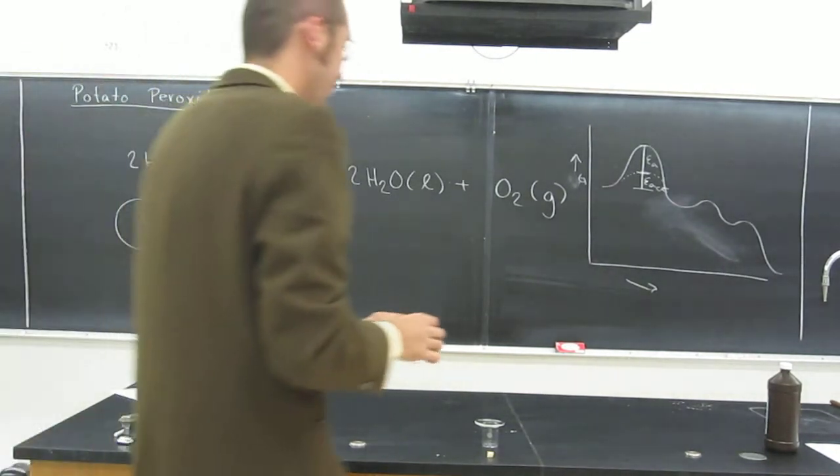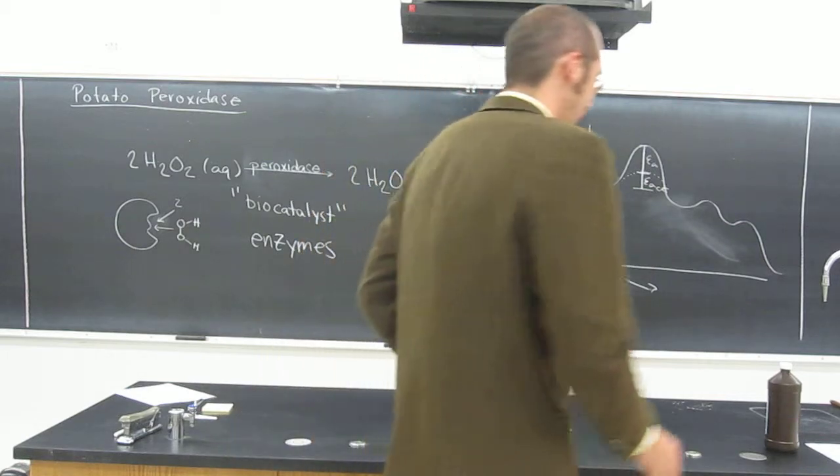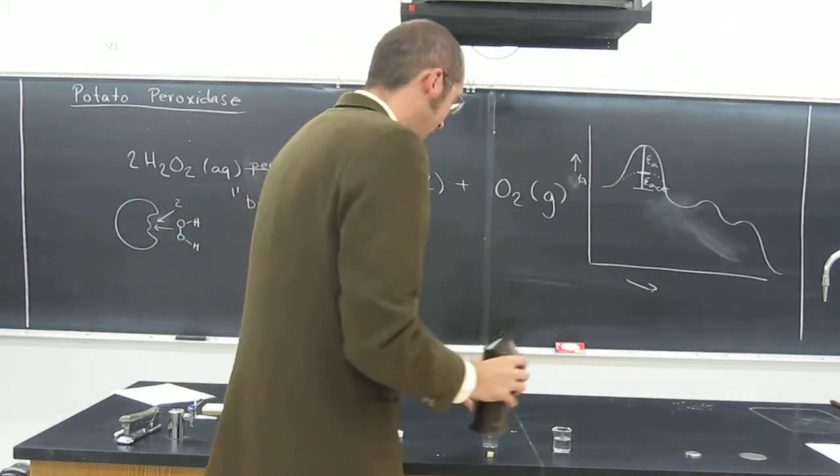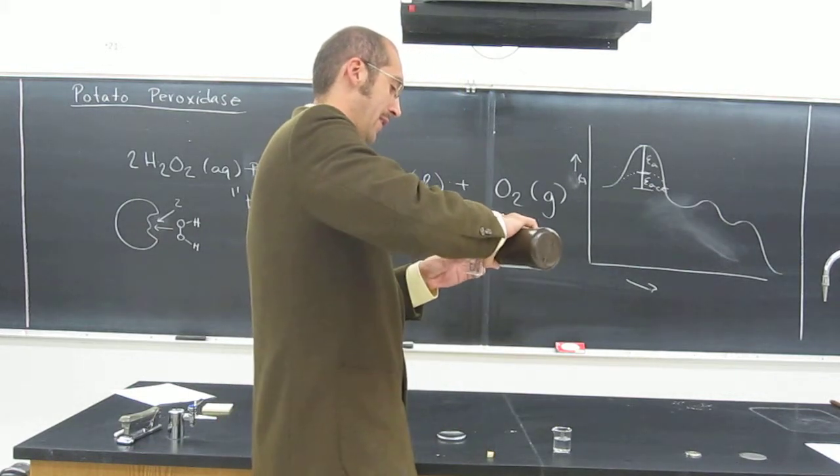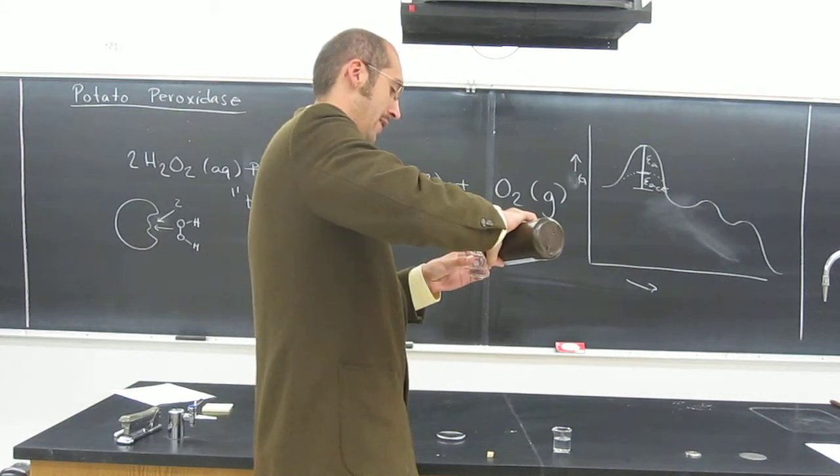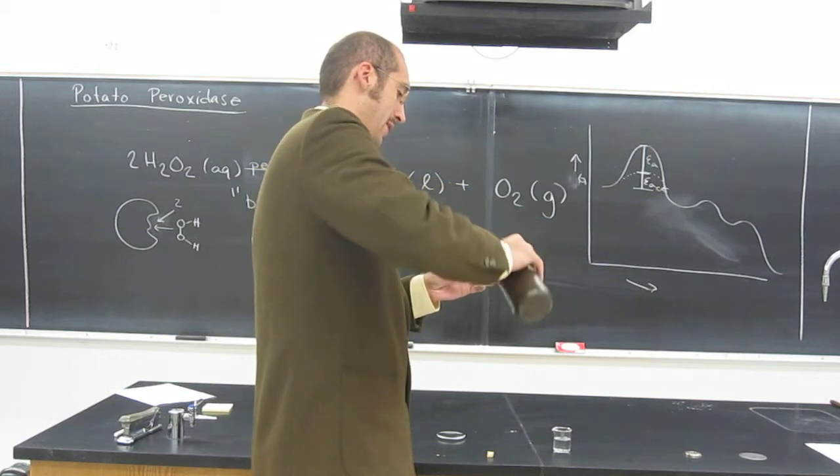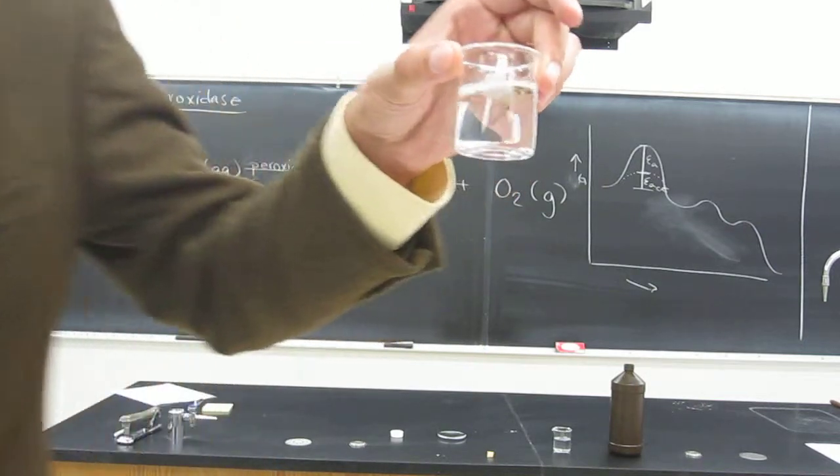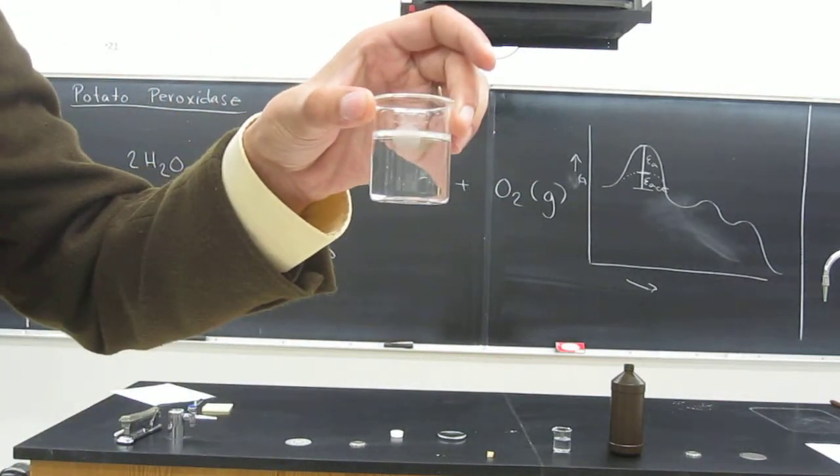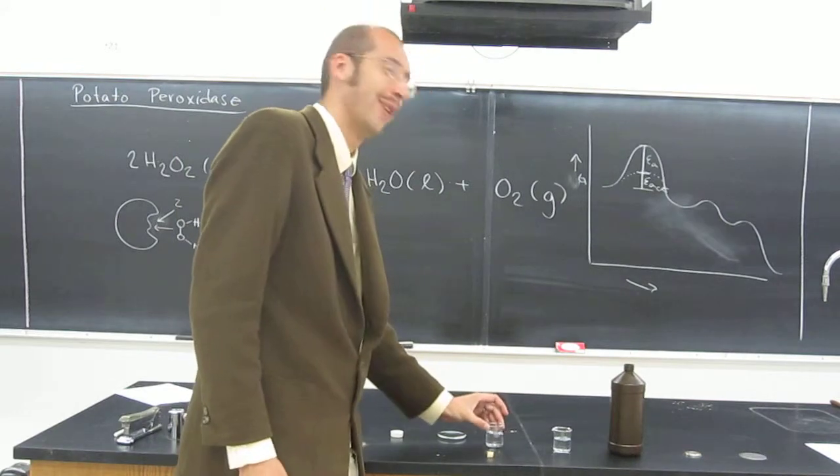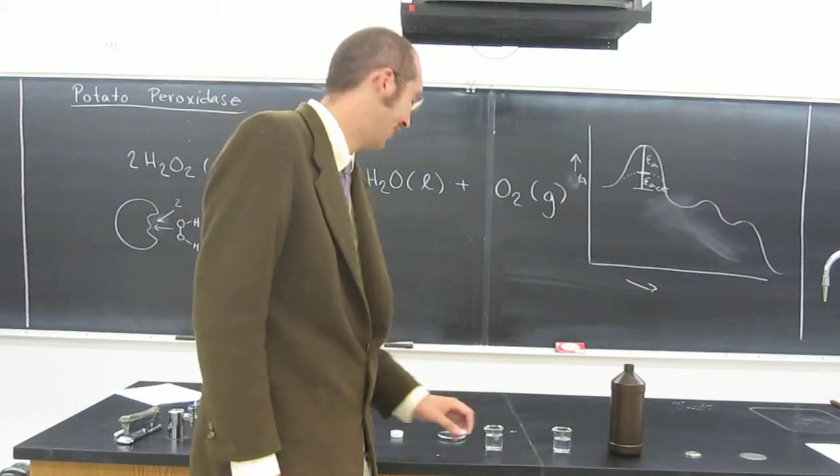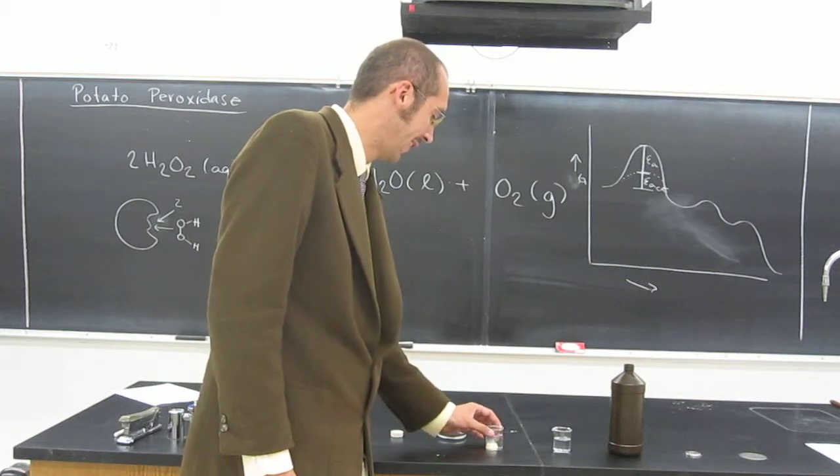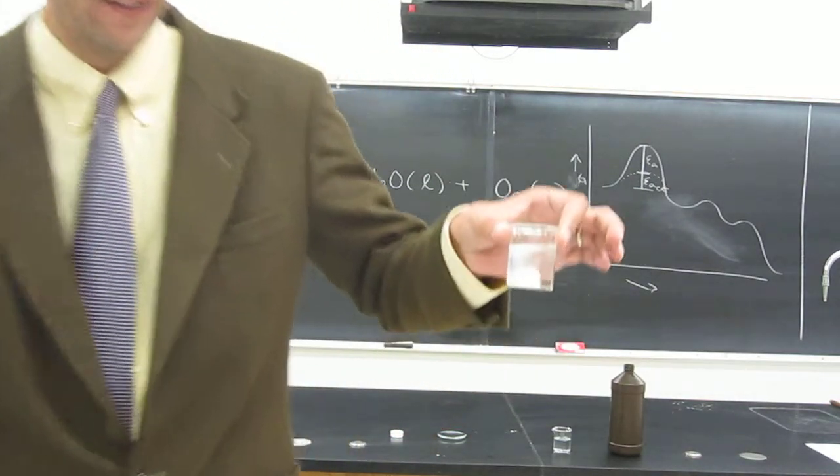Same bottle. And again, nothing's happening. So no reactivity of this thing. So hopefully this works after all this buildup, huh? So let's put the potato in there, you can see. Check that out.